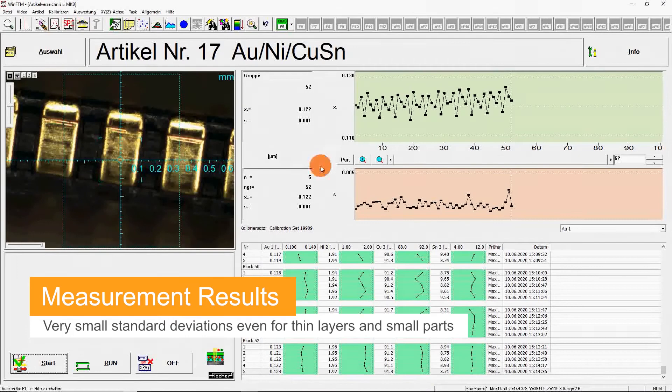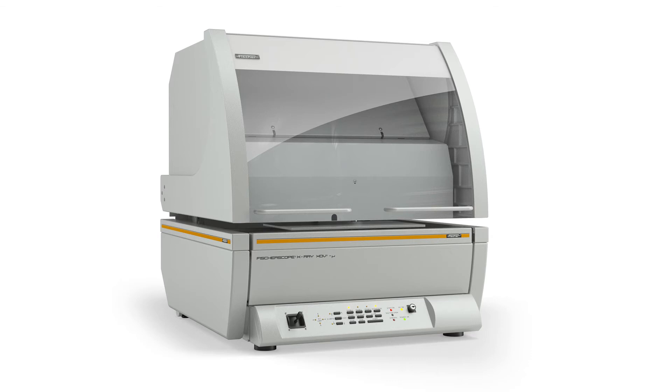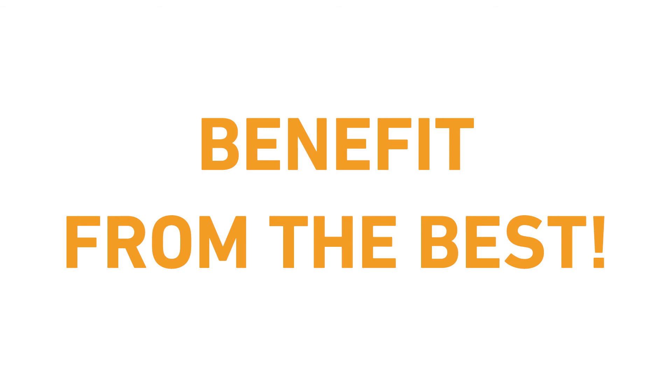Benefit from measurements on small structures, short measuring times, automatic positioning via image recognition and low standard deviation.